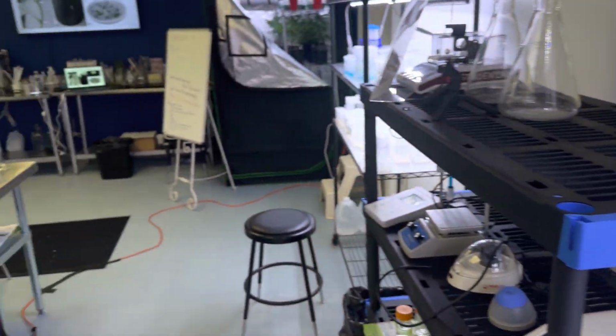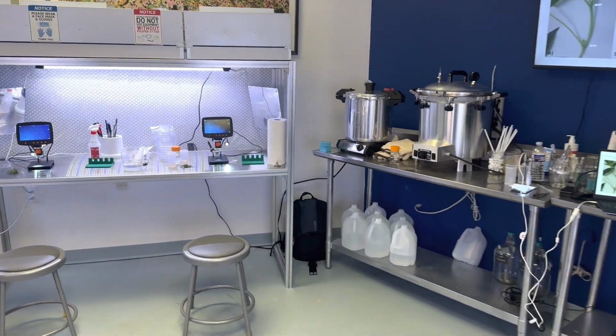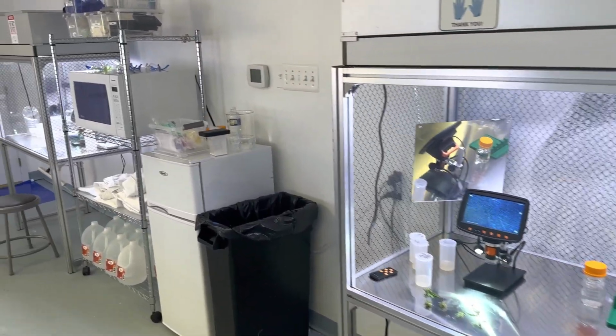And we also do some, like, this is the lab. Let me show you. So we have all the materials for the pressure cookers. We do the microscope work that the other class is doing at the moment.